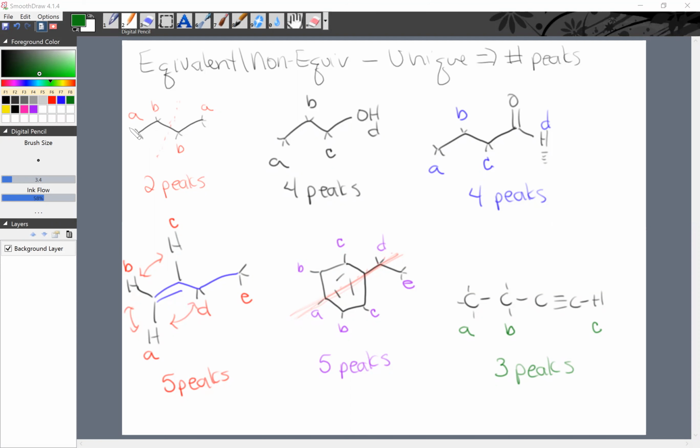And underneath that box, there's 3. Here, there's 2. Here, there's 2. And here, there's 3. Now, this is a very interesting thing because we said that those were not identical. Well, if they're identical, they're going to show up in the same place, which means the peak is just going to be taller than we expect. So peak A is going to integrate for 6 hydrogens, and peak B is going to integrate for 4 hydrogens.